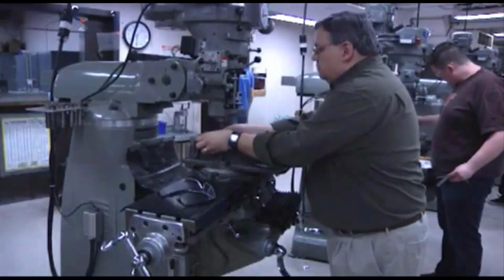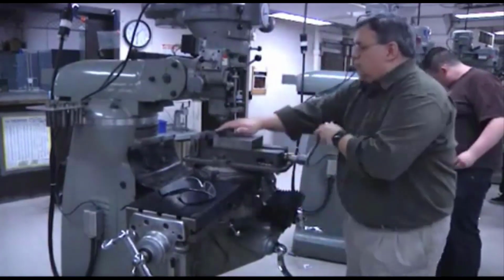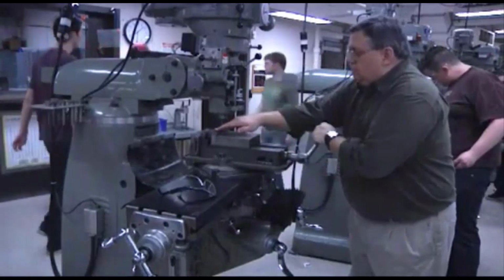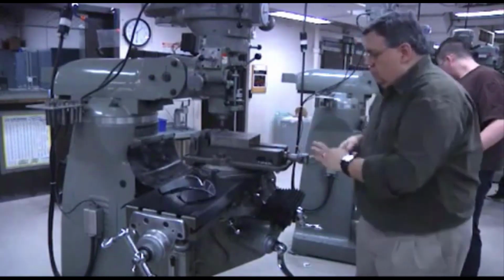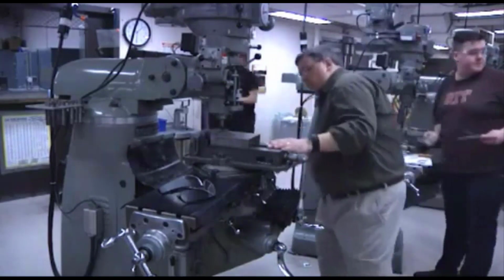So this is the setup and the milling process to put the flat surfaces onto our specimens after they've been quenched so that we can measure Rockwell hardness along the length of the bar. We have a parallel in the vise there to support the specimen. I'm just tapping down on it there to make sure it's resting firmly against that parallel.